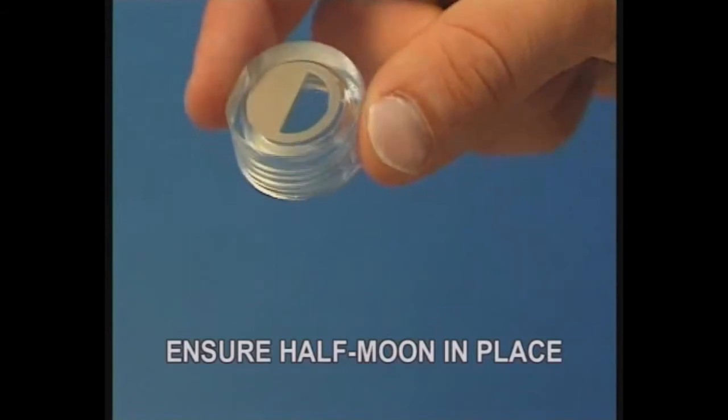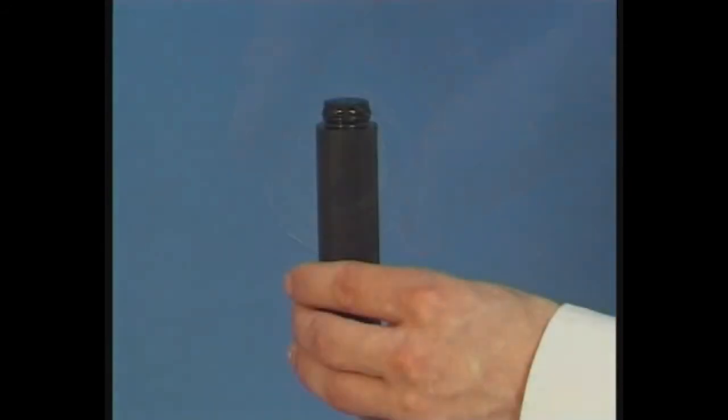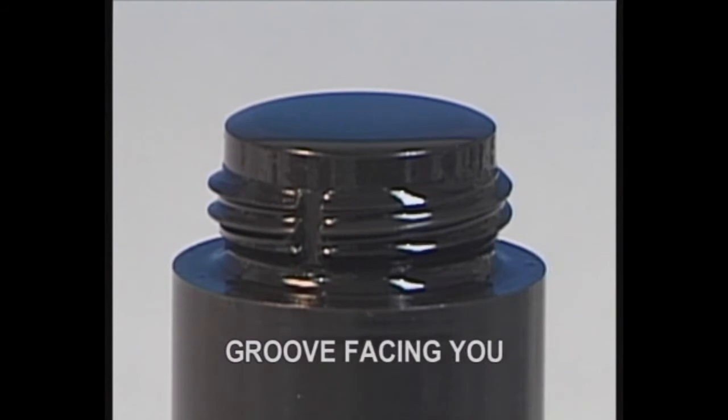Ensure the half moon sighting piece is placed in the end cap. Holding the tube in the vertical, observe the position of the groove in the thread and ensure this is facing you.